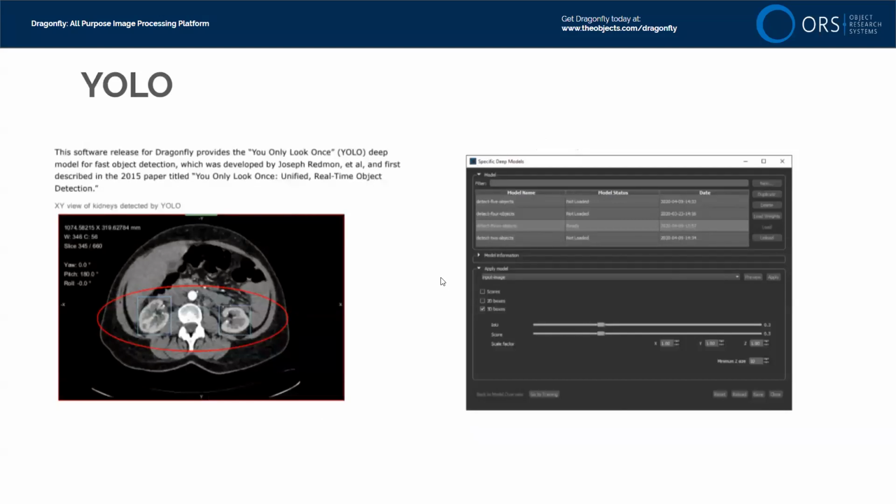Now, the applications we have talked about this week include denoising, super resolution, and image segmentation. One of the things that deep learning accomplished long before semantic segmentation was object detection. So in this field of view, is there a bicyclist in the road I'm driving on? In this field of view, is there a stop sign that I need to interpret and process? So identifying something in the field of view is different from painting the particular pixels of that object. So object detection is a popular feature of deep learning.